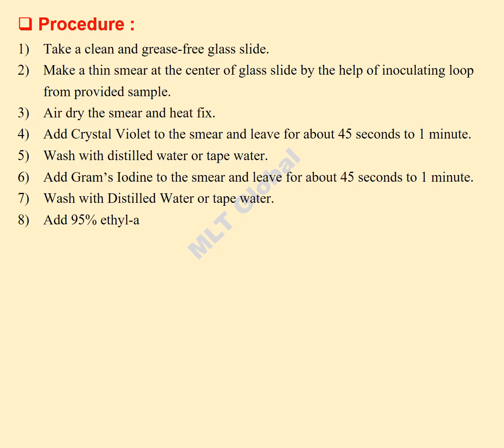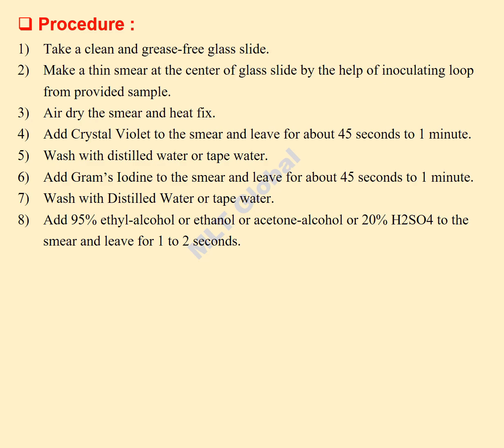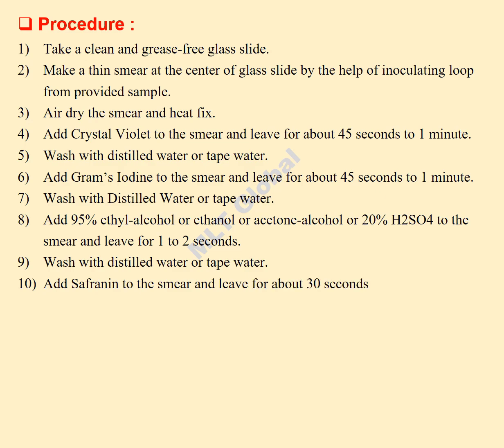Add 95% ethyl alcohol or ethanol or acetone alcohol or 20% H2SO4 to the smear and leave for 1 to 2 seconds. Wash with distilled water or tap water. Add safranin to the smear and leave for about 30 seconds. Wash with distilled water or tap water.